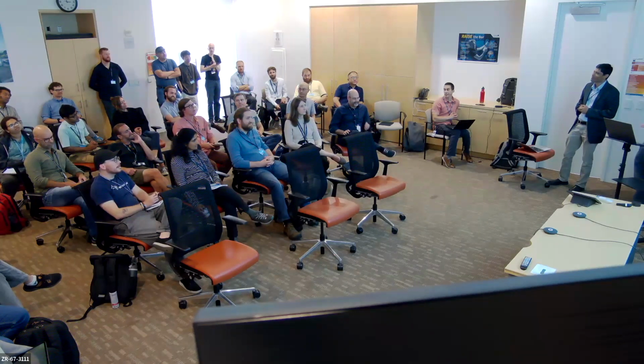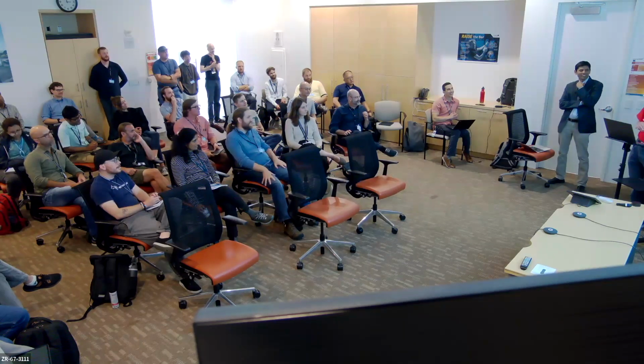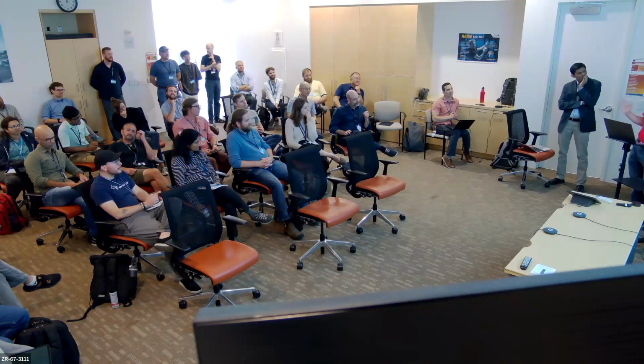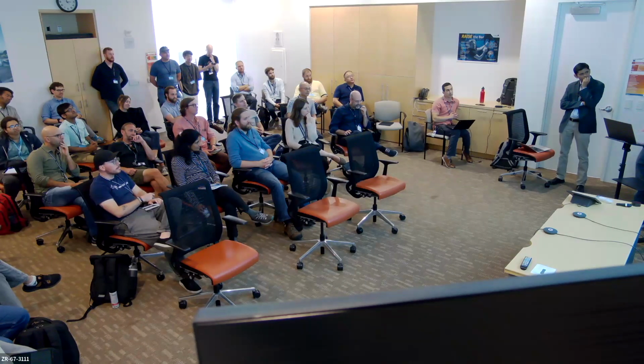My second question was, what's the control for your 17-stack station? Okay, that's hard. Our engineers are really brilliant. They stack up, we talk to different vendors, and figure it out. This is a combination of Kohzu, SmarAct, some customized flexure stage, cube, all different things. I want to let you know that we also have 3 metrology systems there: 2 cap sensor metrology systems and 1 laser interferometer to monitor sample motions.